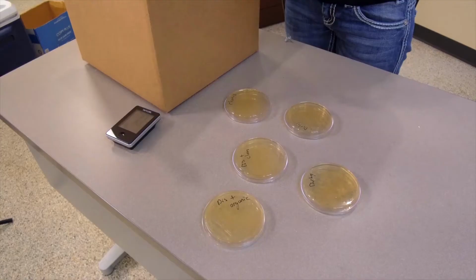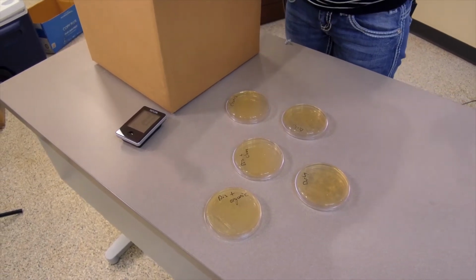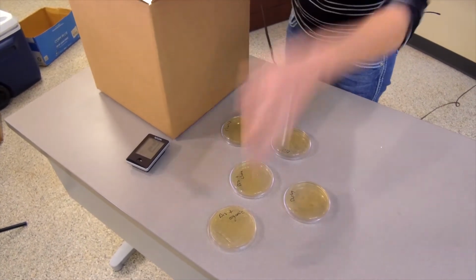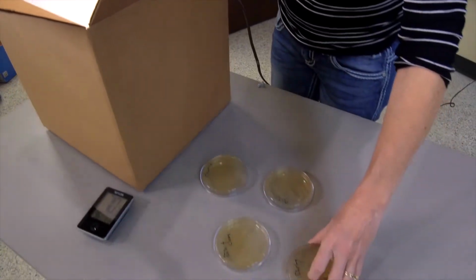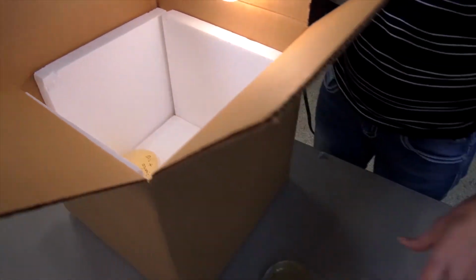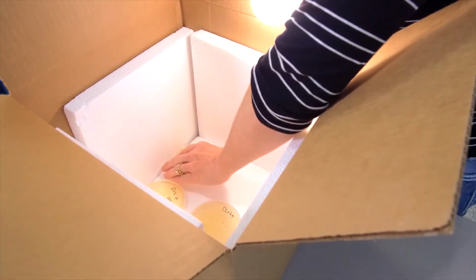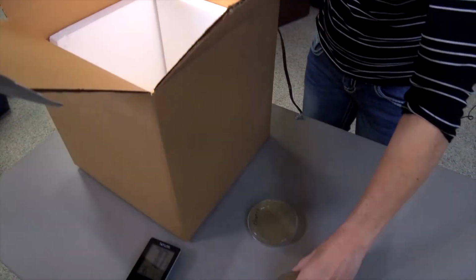So our incubator is now up to temperature. We have all of our plates of our dirty boots, clean boots, disinfected on dirty boots, and then finally our completely cleaned and disinfected boots. So we'll place those agar plates in our incubator. Make sure that the lid is on the bottom, so any condensation that may form on the plates actually drops down onto the lid and not onto our little colonies of bacteria that we're trying to grow.